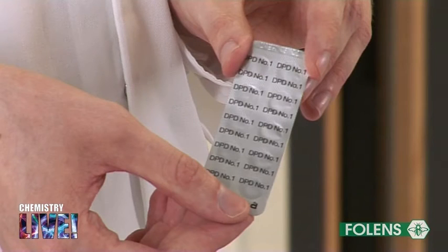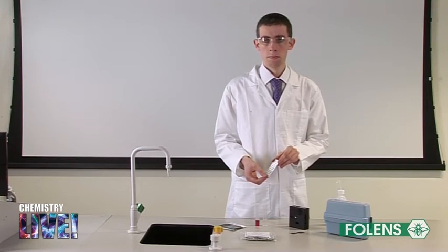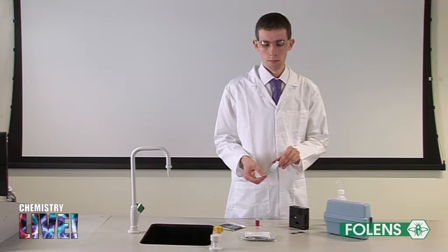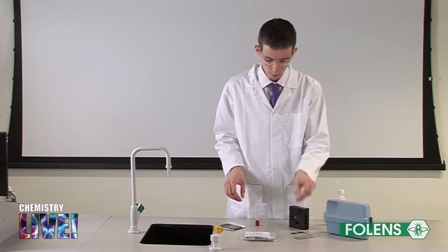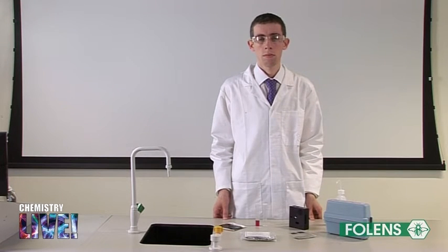You need not worry about knowing any details about this chemical or how it reacts with chlorine. Just be aware that when this chemical and other chemicals are added to the water containing chlorine, they react with the chlorine in the water to give a pink coloured solution. The more chlorine that is present in the solution the pinker the colour.